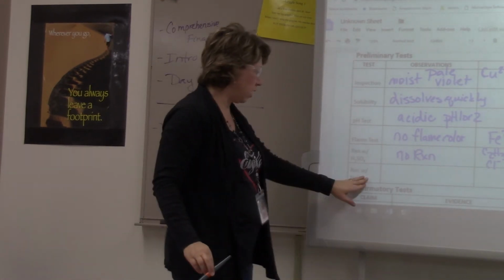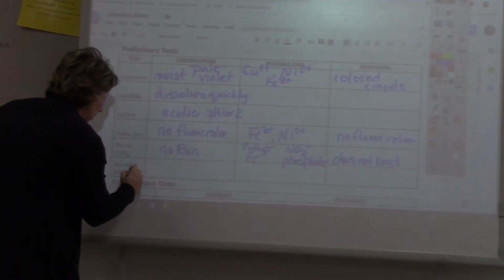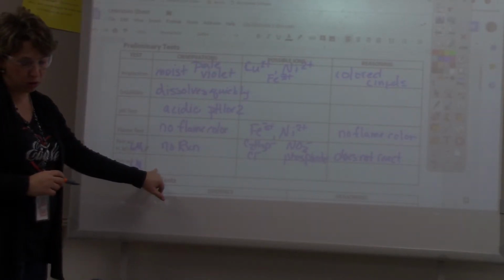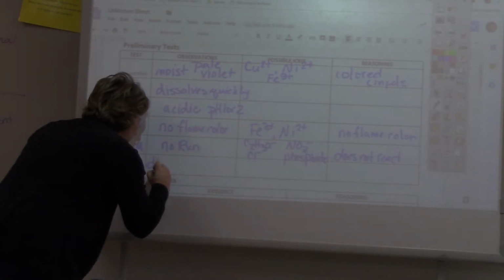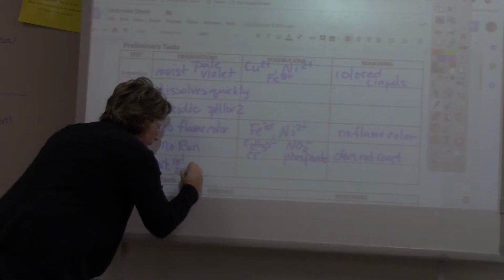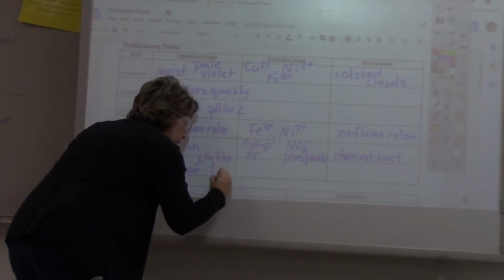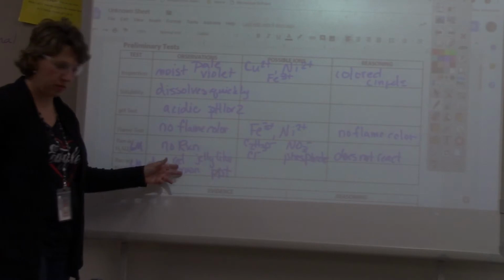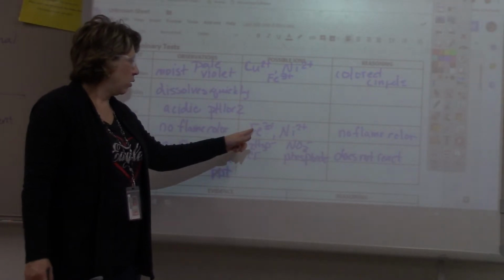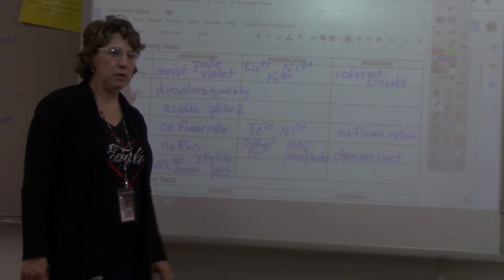So now we're going to come up here on our reaction with sodium hydroxide, and I would also, folks, put here that this is 6 molar. The H2SO4 is also 6 molar. And so now I'm going to write down here that I have a dark red-brown, jelly-like PPT. Interesting. So for this particular one, I'm dealing with my cation. So look at iron and nickel and see, what does it say under iron and nickel? Anything about a precipitate with sodium hydroxide?